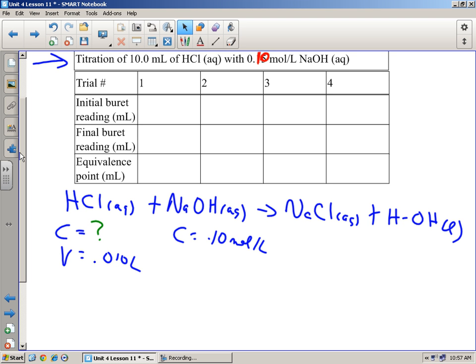Okay. Sodium hydroxide here. That's my titrant. My aliquot is here. This is still my acid. I need to mix the two together. 10 milliliters of acid, check. Got my 0.10 molar solution, sodium hydroxide, titrant, here, check. If I mix the two together, what do you get? This and this, right? Are you going to see sodium chloride being formed?